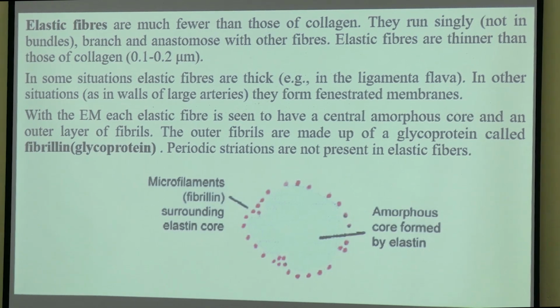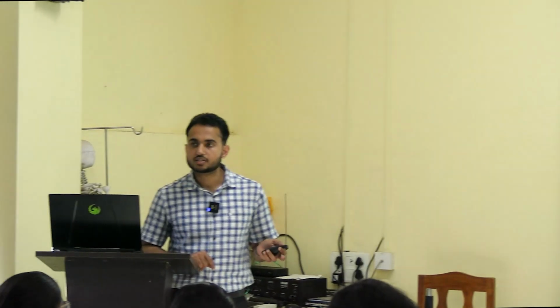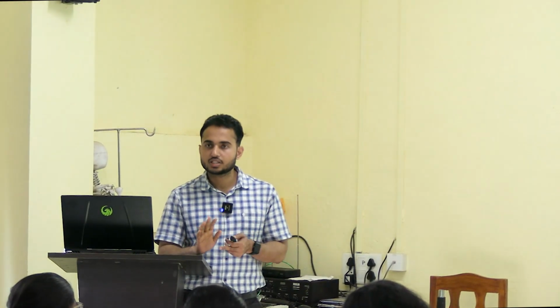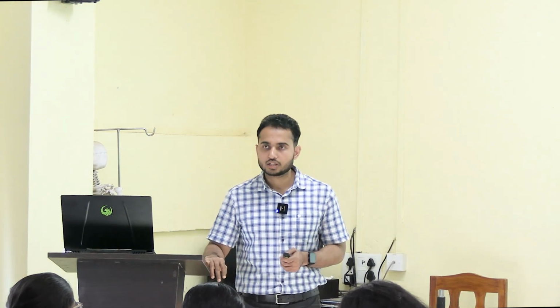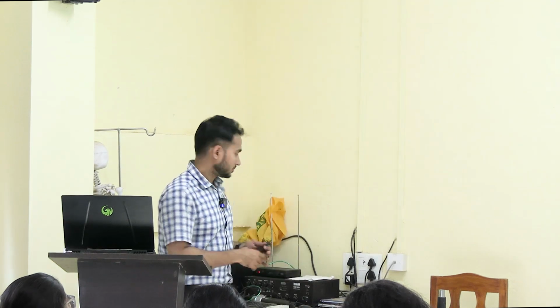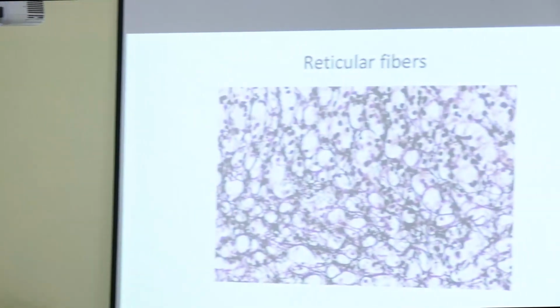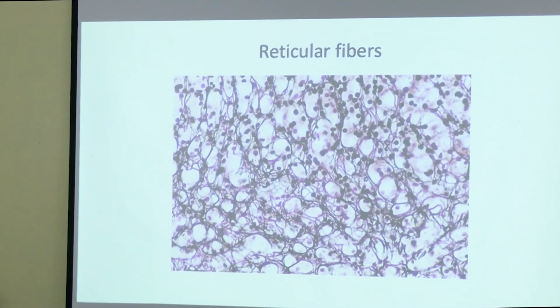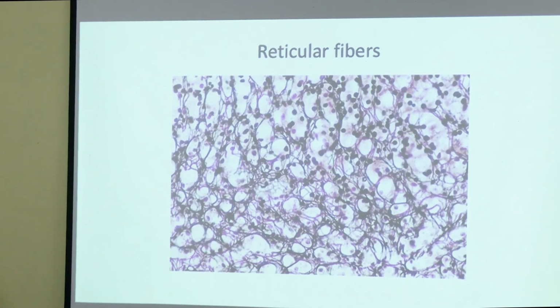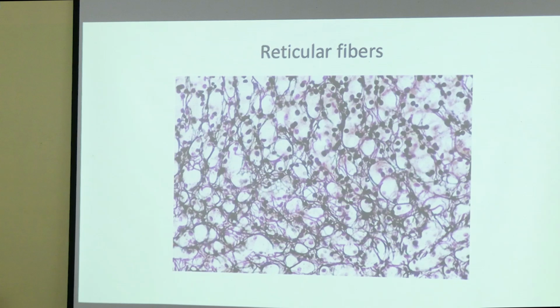So normally the elastic fibers which you will see under compound microscope branch and anastomose with each other, as single fibers. That much you can see. Beyond that you can't see. All those things I will show you today under microscope. Next, these are the reticular fibers. Just now I have told you different types of collagen fibers are there. More than 20 types of collagen fibers are there.